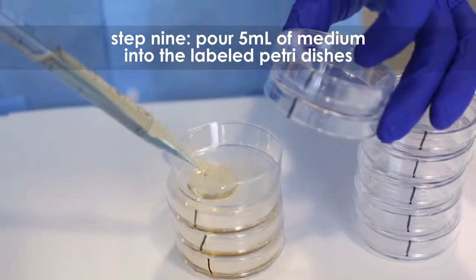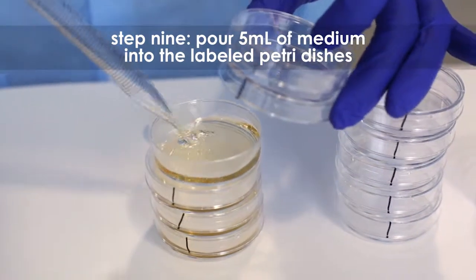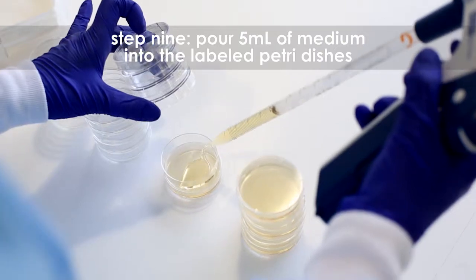Step 9: Using a fresh pipette, pour 5 ml of the medium into labeled petri plates.